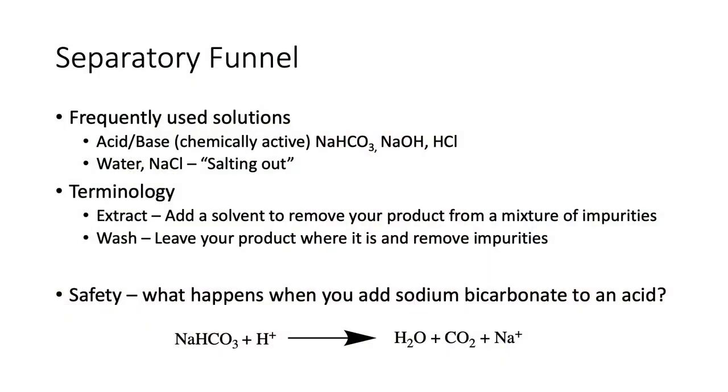And so hopefully that first round of extraction will get rid of our acidic impurities, and then we're going to do another extraction using a sodium chloride solution. And that is sometimes referred to as salting out. So we will keep our product in there, and then we will add sodium chloride solution.